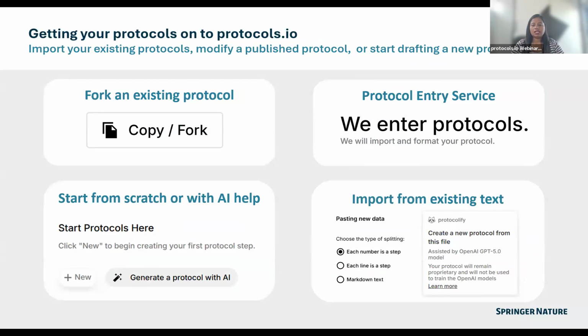So to get started with protocols.io, there are different ways. First, you can fork or copy the existing protocol and use it as a template to build your own protocol. You can also use our protocol entry service, where we will import and transfer the authorship to you. You can also start from scratch or with the help of GenAI, which is a model trained on our Springer Nature scientific material. So you can use that to generate a protocol from scratch.